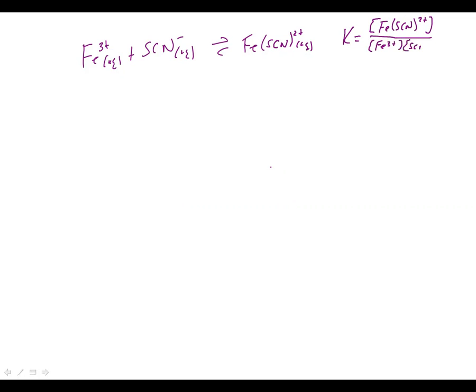Okay. So in the second part of the experiment, in part 2, I'll call it, I don't know if that really is the part number there, but after the Le Chatelier's principle, the goal of this part of the experiment is for you to actually determine the value of K. So you're actually going to determine what the value of K would be in this part of the experiment and get an actual value for it.